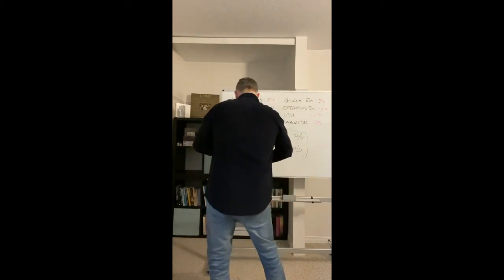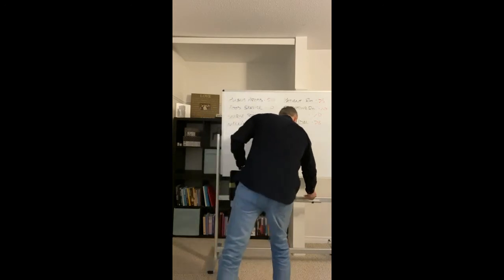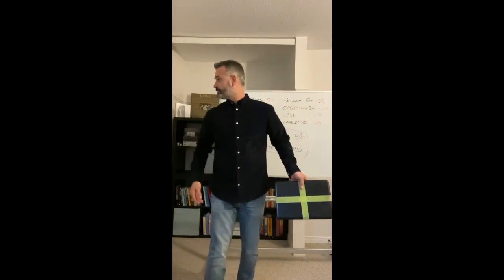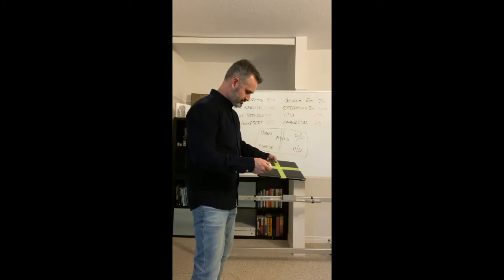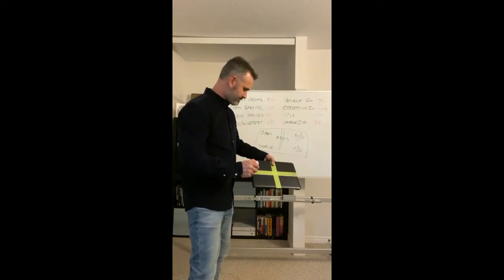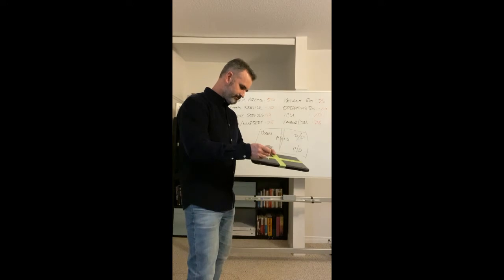All right, so if we go to, so here we have some sanitizer. So you may kind of look at this and go, okay, well, that's not really fair the way you're doing it, because basically you took the sanitizer, you put it on your hands, and then you didn't even wipe it off. But if you think about how we use sanitizer, what do we do? We rub it on with our hands, we let it dry. So we're essentially going to replicate that on the laptop. So going by my diagram here, we're going to sanitize here.